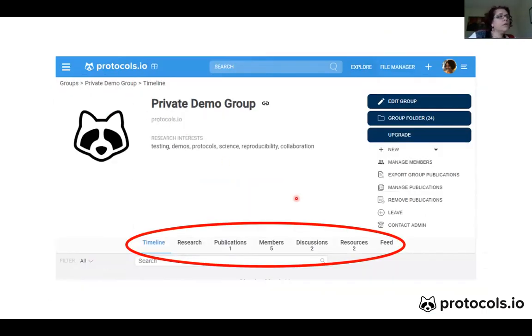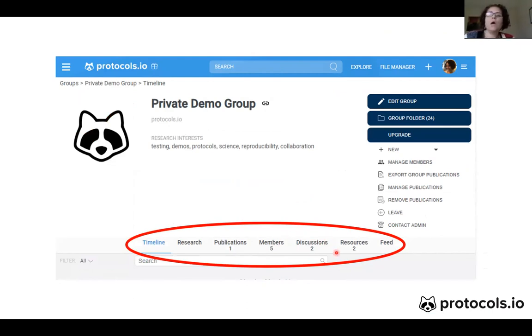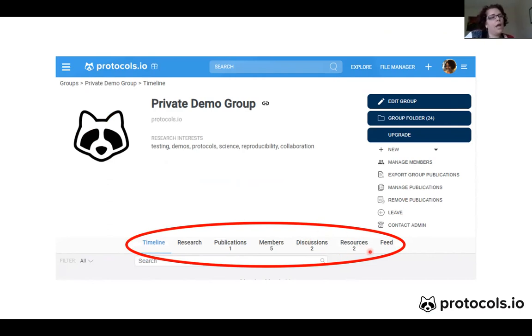Another useful feature is that whenever you are on your group page, you have access to publications, members, and all discussions — both at the protocol level and independent discussions within the group. Protocols in this group are accessible here, and you can also have resources and a feed to see what's going on within the group.